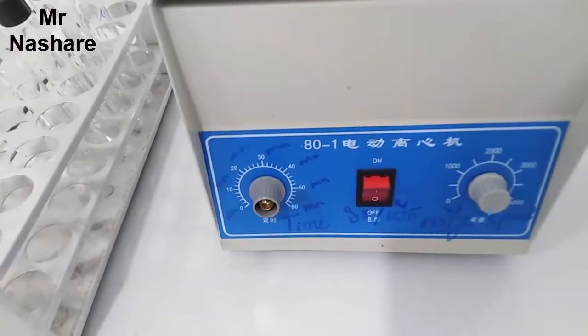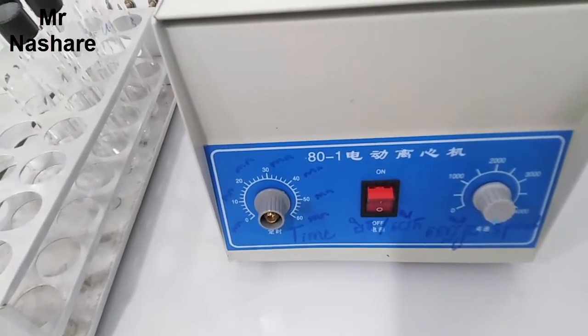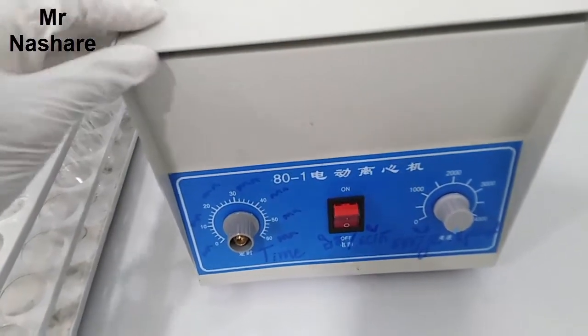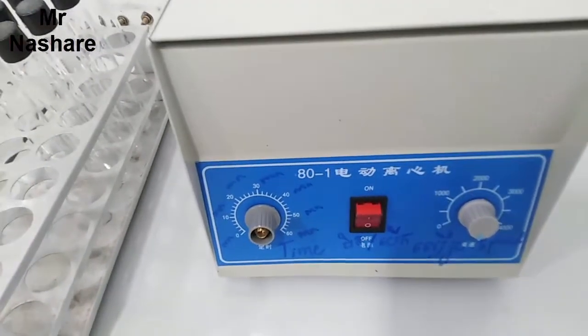Hello everyone. Today I have a machine that is called a centrifuge machine — it is a laboratory device that we use to separate gas or liquid.